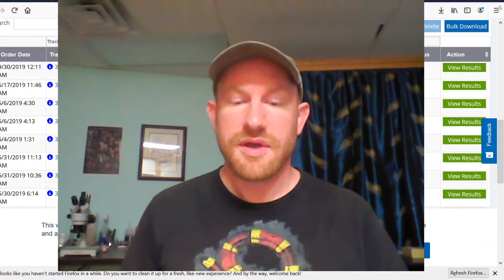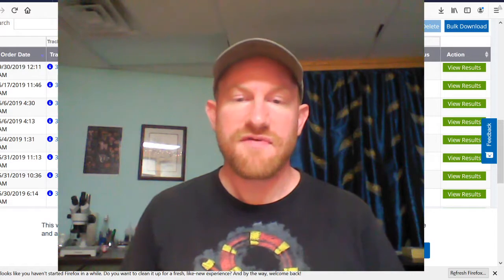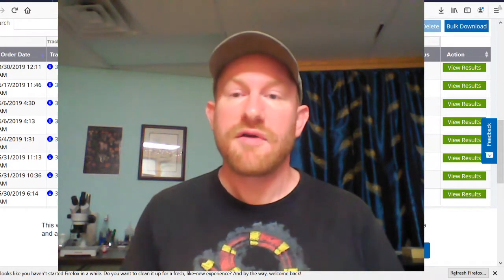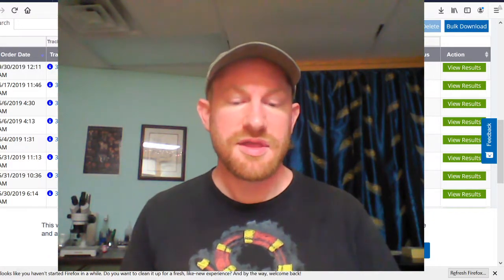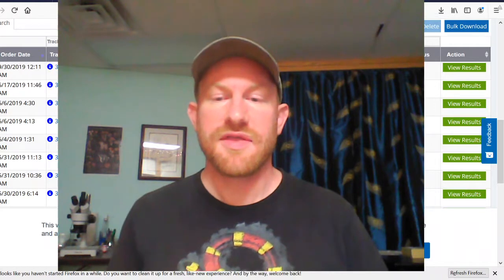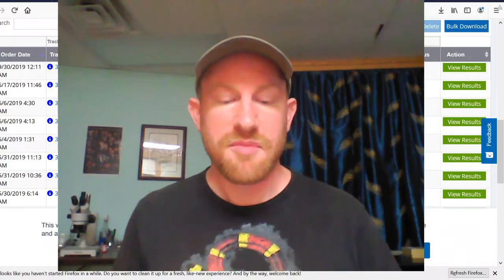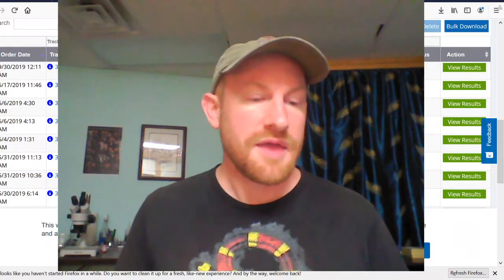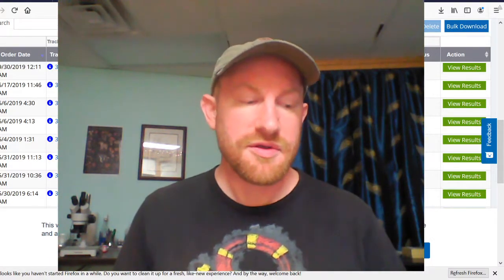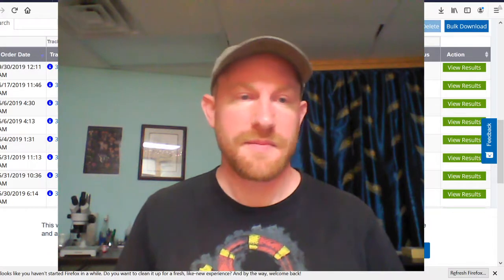And then we're going to use SnapGene to load in the trace file and see if there are any errors in there. We'll verify that the trace is good using BLAST. And then we will submit that to GenBank so the data is available for everybody else forever. And then we can look into how to generate phylogenetic trees to turn your sequences into useful data.